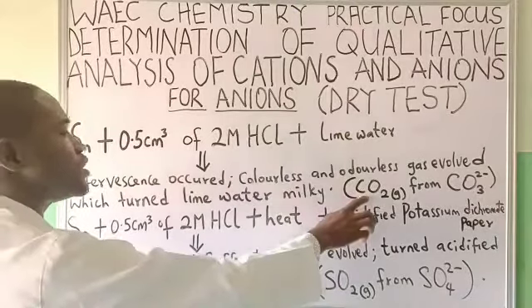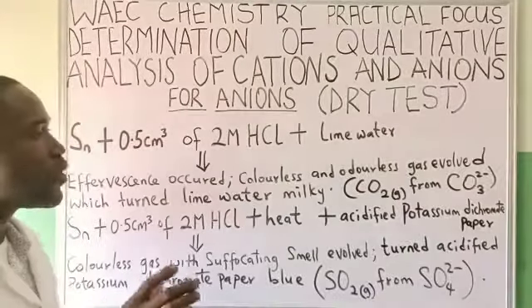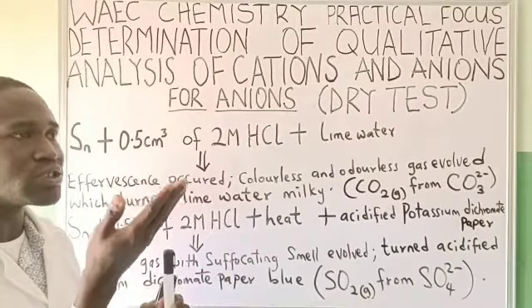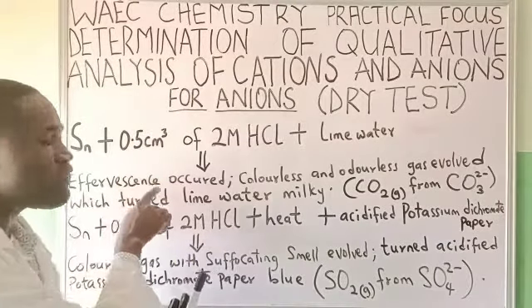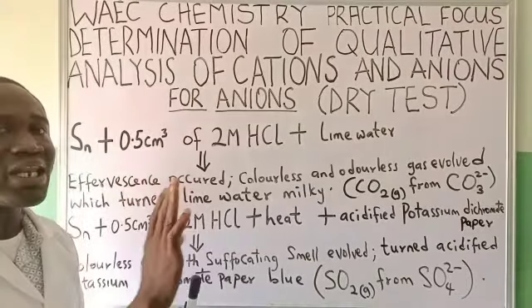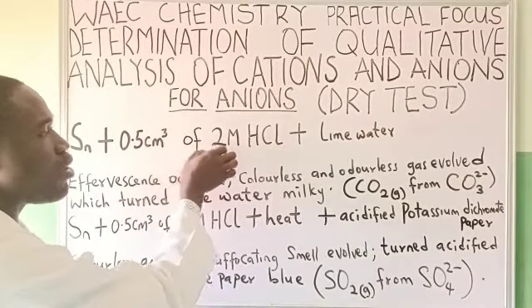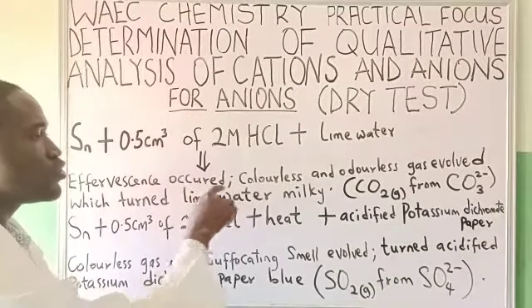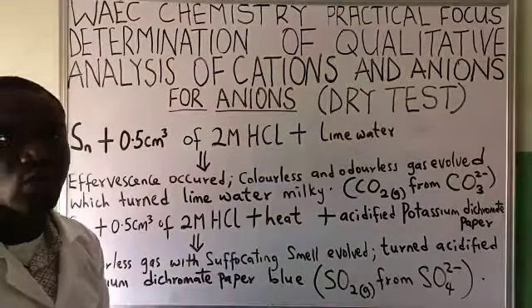They use CO2 gas to preserve it. So when you add that salt, the fumes that you will see is what we call effervescence. That is how it will react, to let you know that CO2 gas is present in that salt sample.